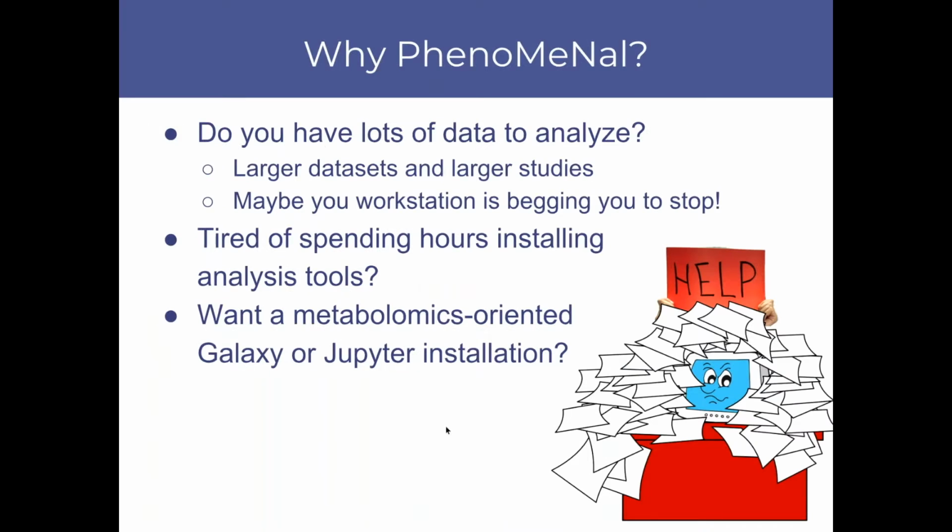So why might you be interested in PhenoMeNal? So I wonder, do you have a lot of data to analyze? These days we're generating larger data sets, we're running larger studies. Maybe you're running everything on your workstation and it's just begging you to stop. Maybe you realize you need something a little more sophisticated to run your data analysis.